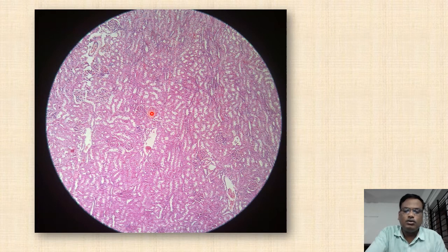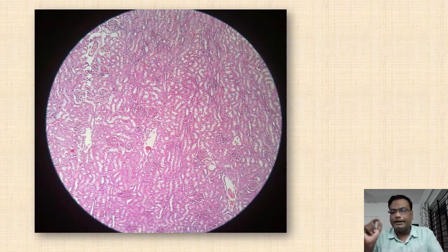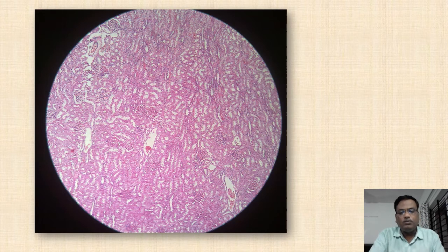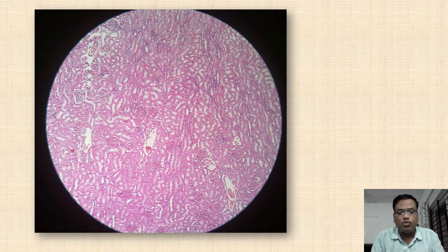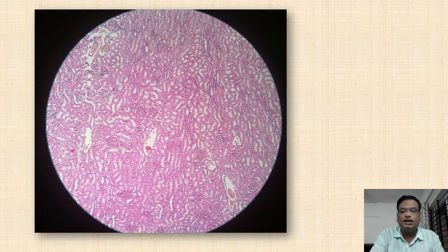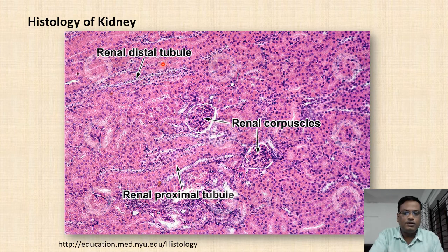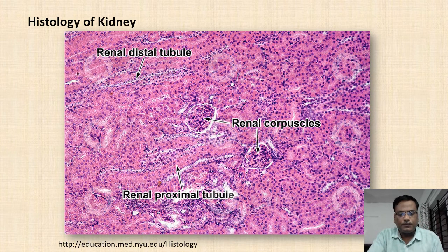Each renal corpuscle represents one nephron. The other structures visible in the section are ducts — they may be proximal convoluted tubules or distal convoluted tubules. We can differentiate proximal and distal convoluted tubules based on the type of epithelial cells bordering the tubule. The cortex part of the kidney thus shows renal corpuscles along with the proximal and distal tubules.